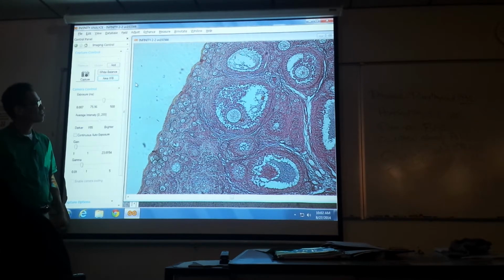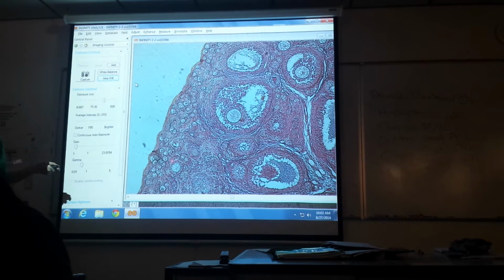Let's see. Well, that's kind of Graafian, kind of secondary. That's more Graafian. It's not really secondary. I don't think there's a good secondary on here, but we've got Graafian. This is a perfect example. I don't know if you can see it in the back. Let me raise it up so you can see it better. Let me take a picture of this before we do that.